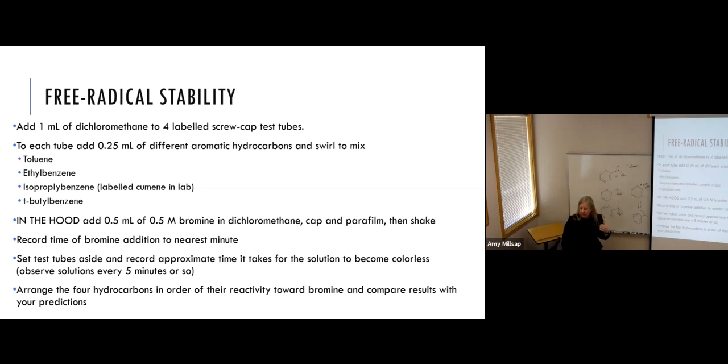So that's why I say start with this one. It's super fast. And once you do the bromine addition, you just have to occasionally glance at it. You can be doing something else while you're waiting.